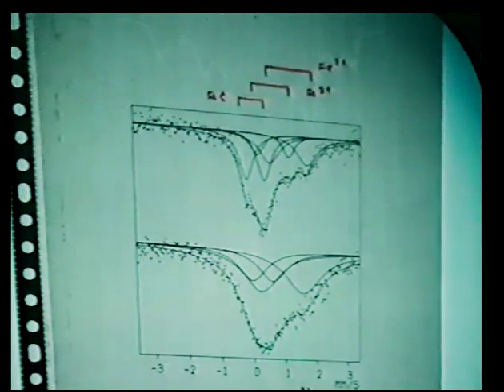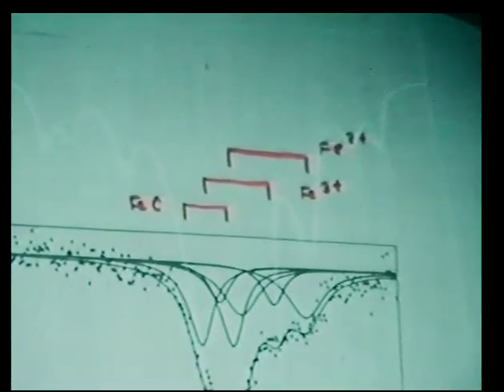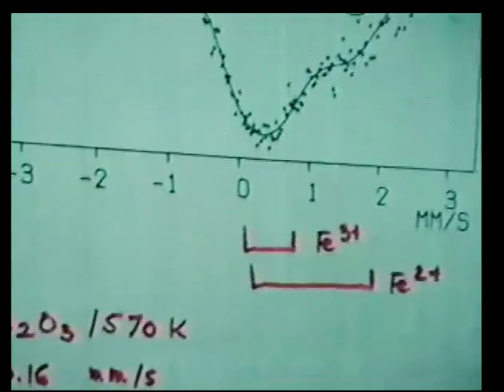We designed an in situ Mossbauer cell, which was working at high temperature, and you could measure it at even low temperature without exposing the catalyst to air, and without changing from one side to the other, just to avoid the oxidation during the transfer of the probe.